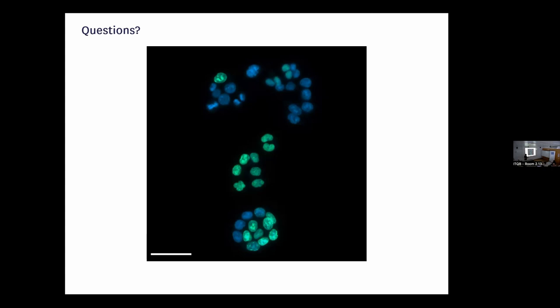Another application that I did not show that you can use FRET for is in the same molecule. You could have the same molecule with donor and acceptor, which shows no FRET signal, and then it changes conformation in some biological process, and the donor and acceptor become close to each other, and then you have FRET. So you can also use FRET pairs labeling the same molecule to detect conformational changes. I haven't shown that, but that can also be done.